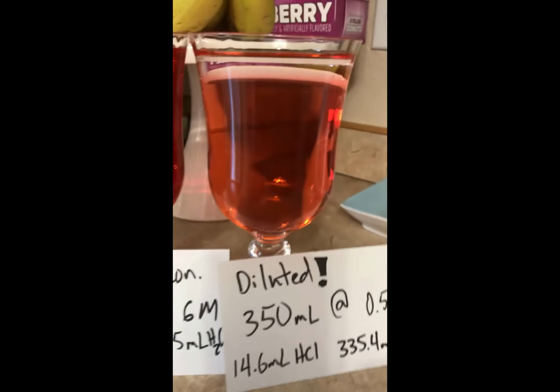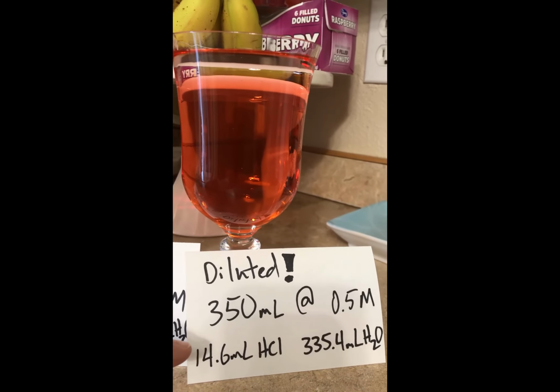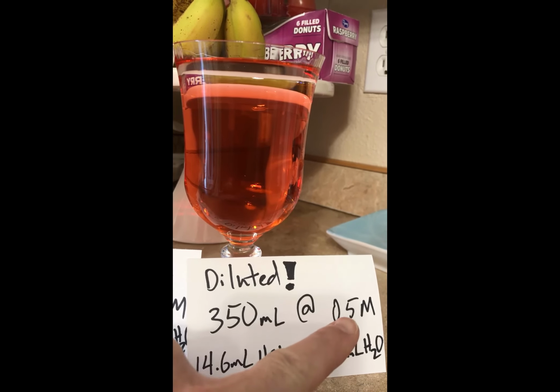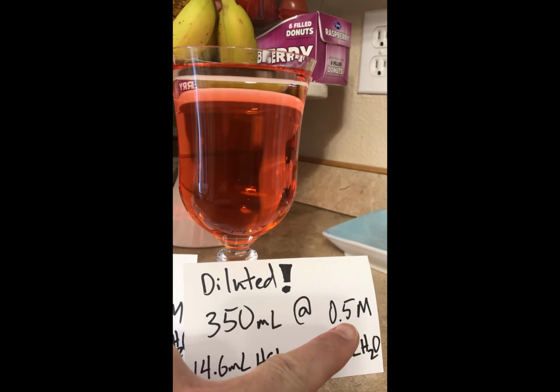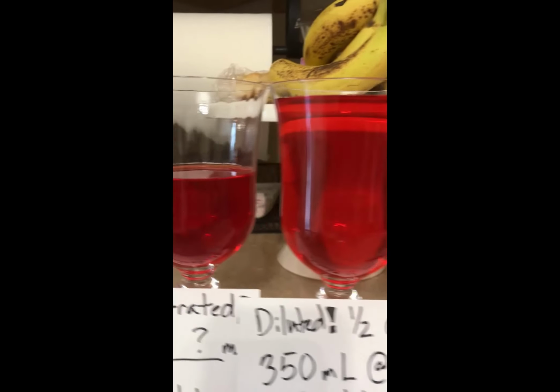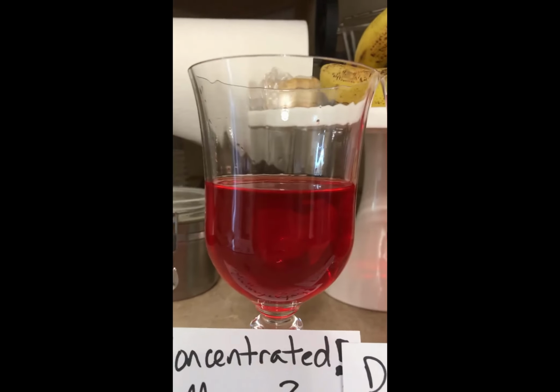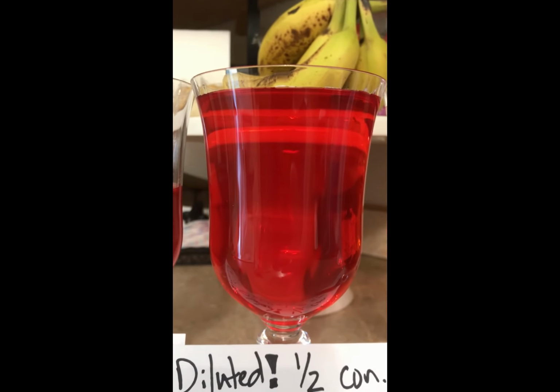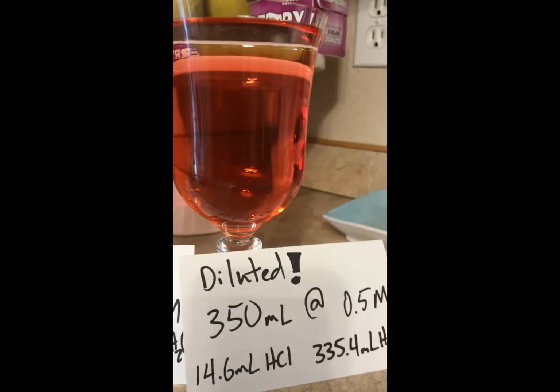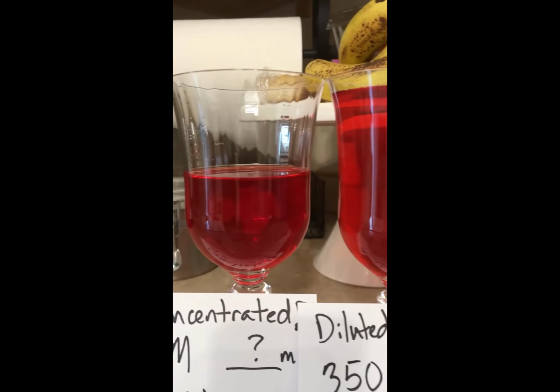Okay, so here we go. This one is all mixed up. If you take a look, if we were using hydrochloric acid, we would only measure out 14.6 milliliters of the hydrochloric acid. Way more water. This is way more diluted. Okay, not very strong. And if we compare these to our other ones, here's our stock 12 molar. It's really strong. This is going to be half diluted, 50% strength, 6 molar, and then this is going to be our super diluted, 0.5 molar. And you can see the color differences and the variation there.